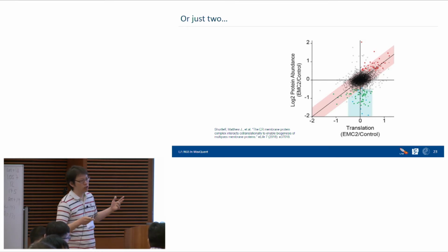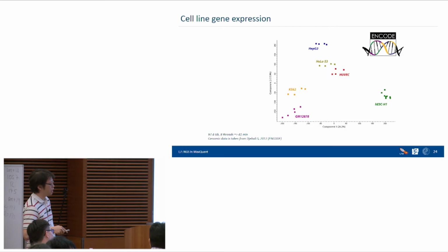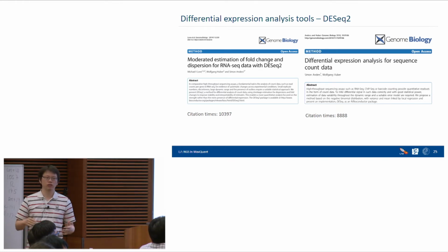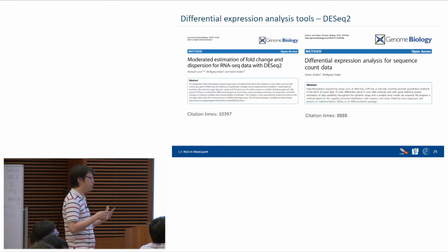Of course, we can also do just two omics data. For example, here in translation and proteins, we have the experimental set and also a control. You can see in the translation process, the genes in the green part do not change a lot. But in proteins, they are hugely downregulated. So what happens here is also very interesting for us to discover. Of course, we can also simply classify the data to see how similar our samples are, using something easy like PCA. This is already built into Perseus.